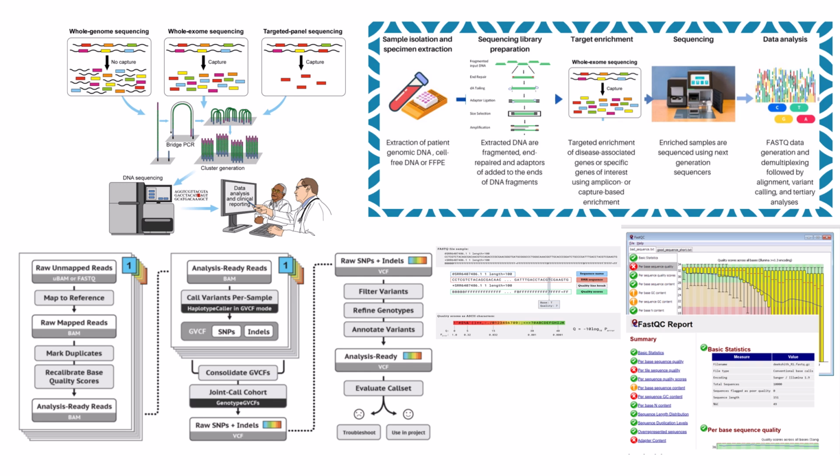Okay, we've journeyed from billions of raw reads down to this refined, high-confidence list of variants in the right places. But just having the list, a C changed to a T at position X, that doesn't tell you what it means clinically, right? Not at all. Identifying a variation is just one part. Understanding its potential significance is the next crucial step. And that's Phase 6, interpreting variants, annotation. Annotation, giving meaning to the variations.